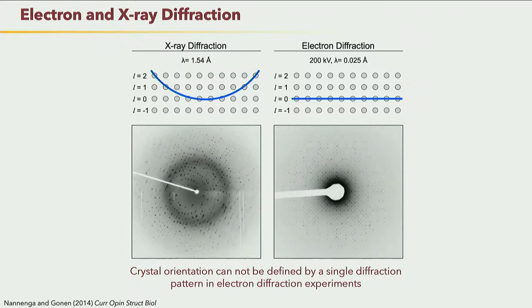That's because of what's called the Ewald sphere. It's a geometric representation of when Bragg's law is satisfied. In this cartoon up here, which is a very simplistic view but hopefully gets the point across, these spots would be your spots in reciprocal space. So you've got, say, L going up and down, H maybe going left and right, and maybe K coming in and out of the board, for example.